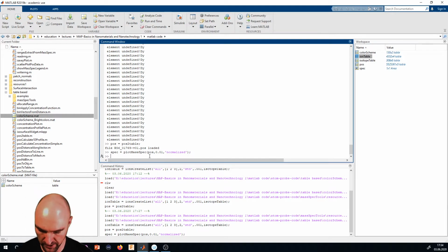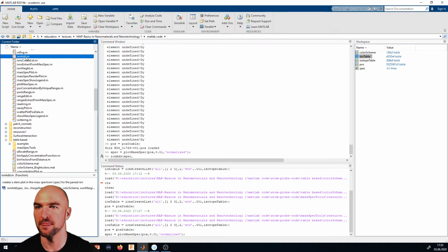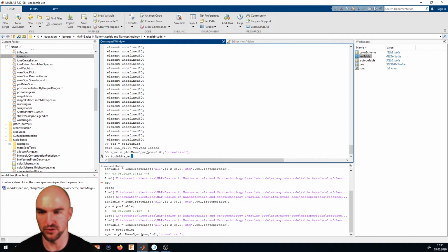And to do that, we can just go, in this case, ion add, and into our spectrum. And sorry, I'll just copy the ion add in so that I don't forget all the different things that I need to use. But usually this is now just to show you, usually obviously we heavily make use of autocomplete.